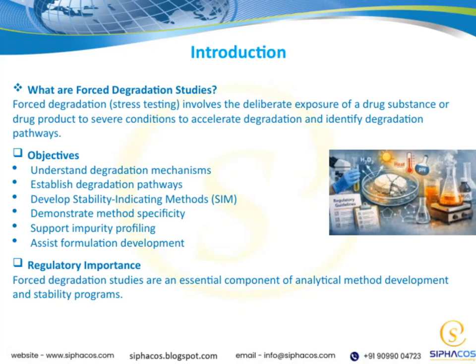Let's start by looking at forced degradation studies, sometimes called stress testing. This process means deliberately exposing a drug or its components to harsh conditions. Why? To speed up how it breaks down and to uncover the ways it degrades. Our goals here are clear: to understand those breakdown mechanisms, map out the degradation pathways, and develop stability-indicating methods that can detect changes accurately. These studies also prove method specificity, help profile impurities, and support formulation development. They're a crucial part of both analytical method development and meeting regulatory expectations.